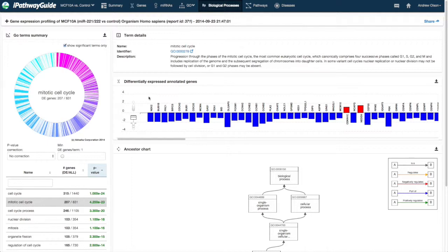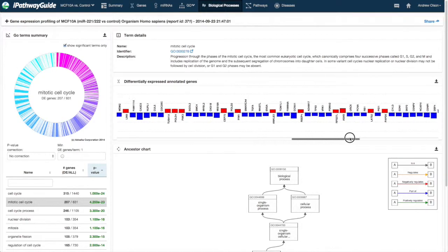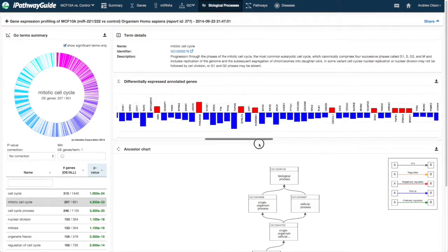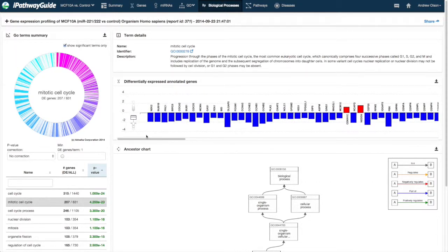In the DE Annotated Gene section, a bar plot of the DE genes annotated for that term are presented in ranked order by p-value for each gene along with its measured log-fold change.